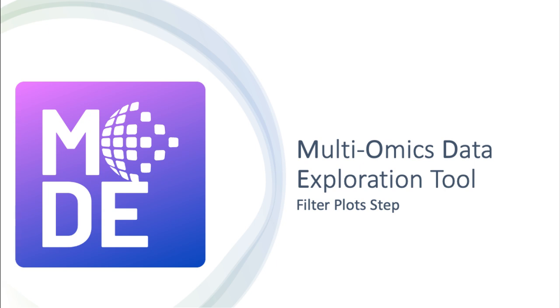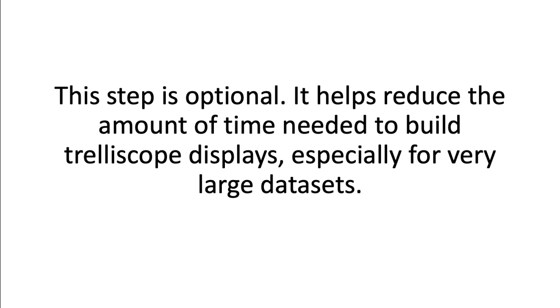Now, we will cover how to filter down the number of plots in Mode. This step is optional and helpful for reducing the amount of time a Trelliscope needs to build. For certain datasets, like very large transcriptomics and proteomics datasets, it is possible that there are many plots that are not needed and could be filtered out to reduce build times.